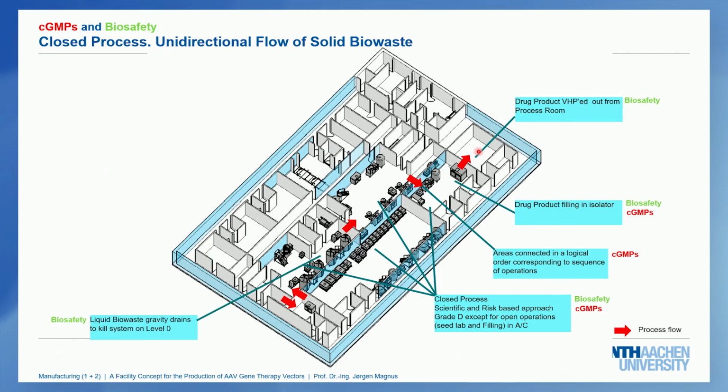The liquid biowaste is sent down to the ground level to the kill tanks, where it's heated to, for instance, 130 degrees for half an hour, just to kill all the biological activity, and then it can be released to a wastewater treatment. That is related to biosafety.